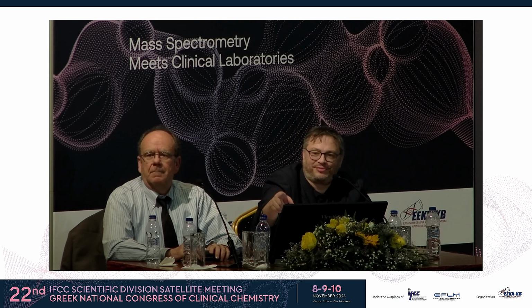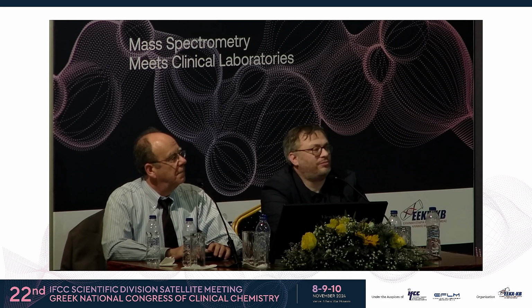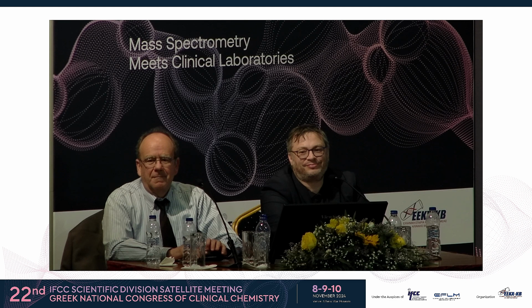One question? Okay. Yes, thank you for the talk. We did evaluate a kit some years ago from SciEx, the iTRAQ. I was the developer. Okay, so you might appreciate this question. We tried to apply that kit as an evaluation to actual pathological samples. And one of the things that we found in certain conditions was that the stoichiometry was quite poor.